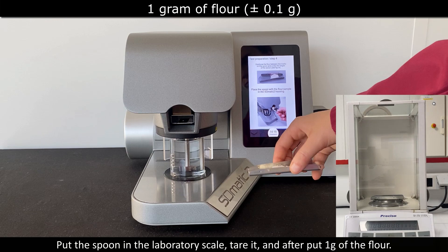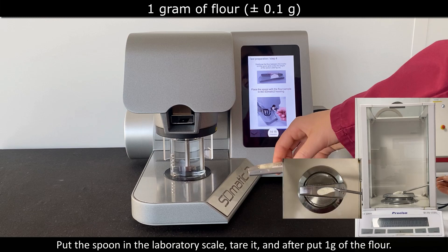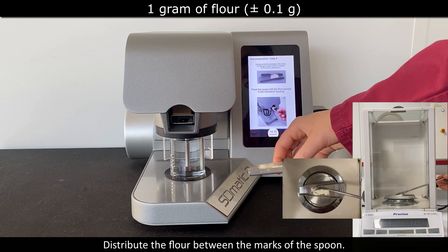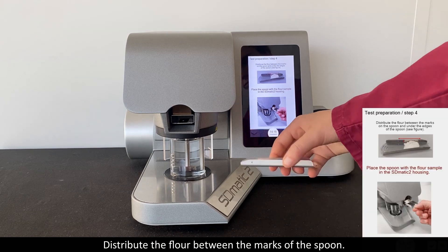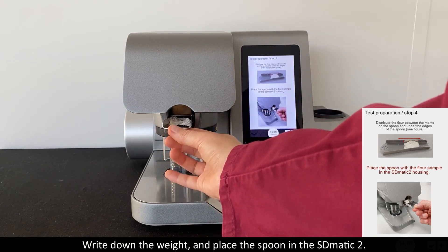To place the spoon onto the laboratory scale, tare it and then put 1 g of flour. Simply distribute the flour evenly between the marks of the spoon.